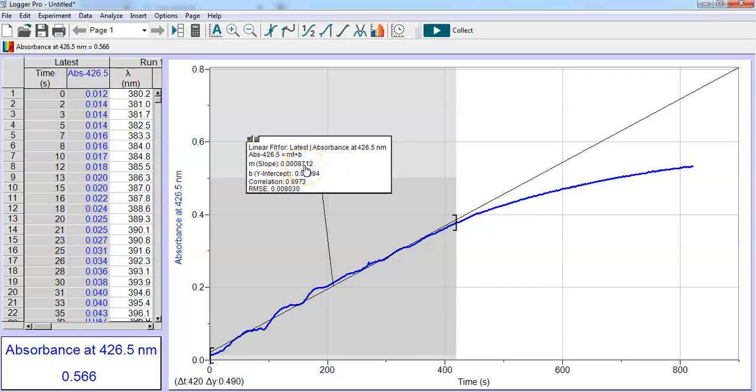And so the slope is equal to 0.00087, which of course is a very small slope, but this tells you about the rate of the reaction, the change in absorbance over time. And you'll want to compare the slope of your different reactions. You're going to manipulate the environmental variables, and then you'll look at how slope varies depending on how environmental conditions vary.